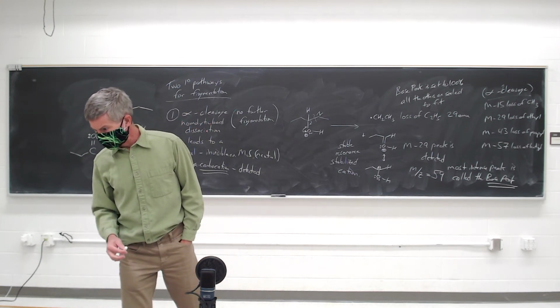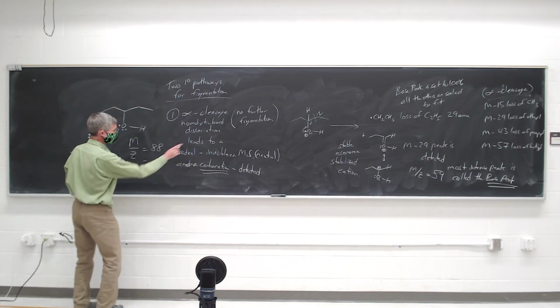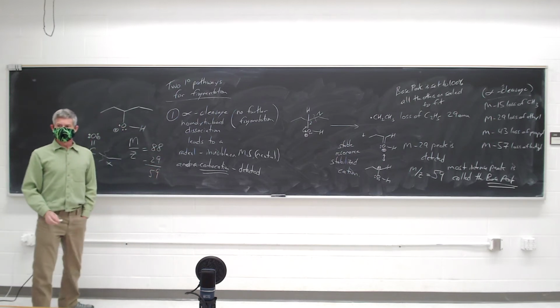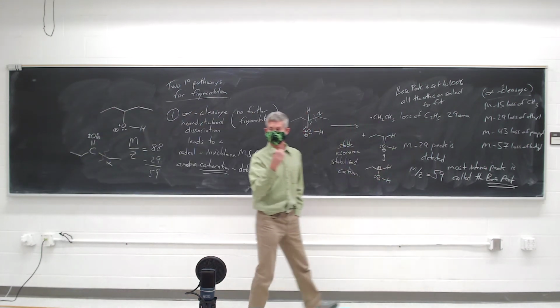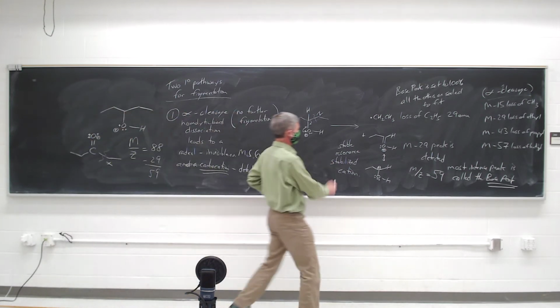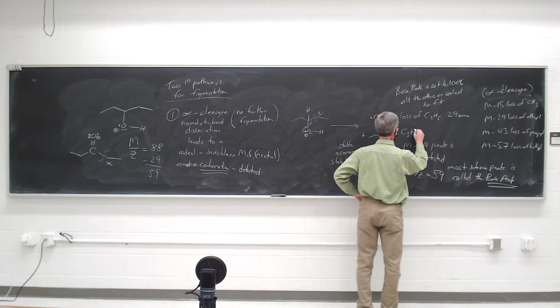Can you explain how you got to 59? Yeah, I took 88 and I subtracted the 29. Oh, okay, thank you so much. 7 minus 2 is 5. So this peak is gone. 29 atomic masses, 2 carbons and 5 hydrogens, have been spit out in an invisible fragment, and what we're left with is the remainder. You could also do this by noticing this is C3H7O.